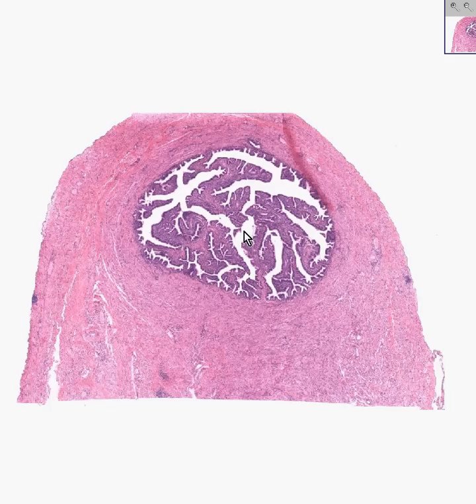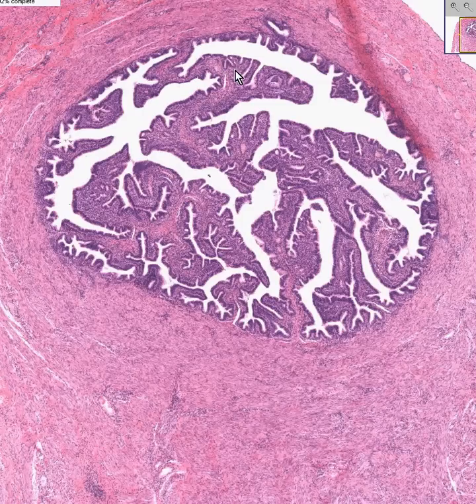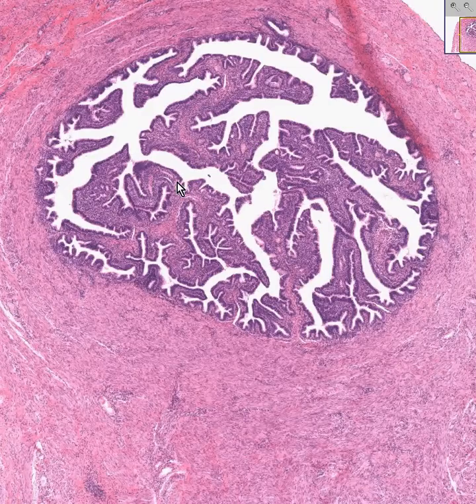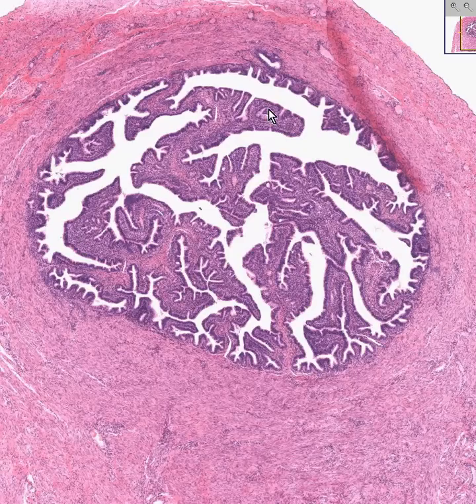Where it ends near the surface of the ovary, it has these little papillary structures called fimbria. In another part of the tube where the lumen is still basically dilated, it has a mucosa which contains papillary projections — really the same thing that fimbria are composed of. When it gets closer to the uterus, it basically loses this papillary configuration and is just a round, flat mucosa.